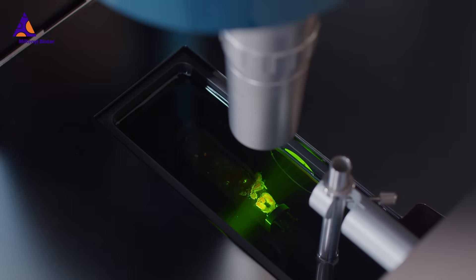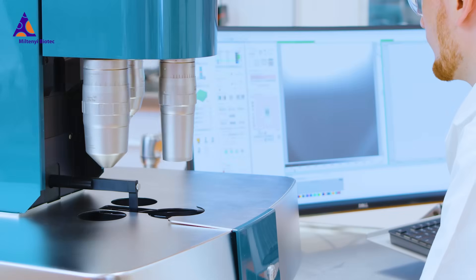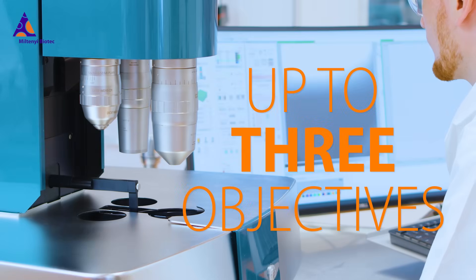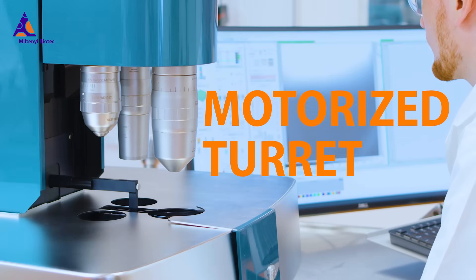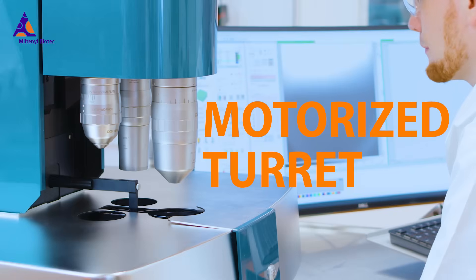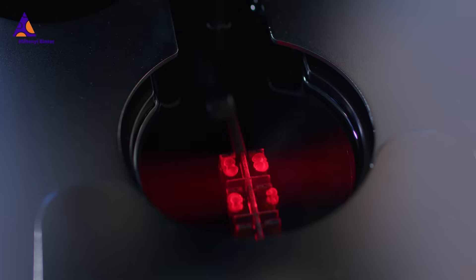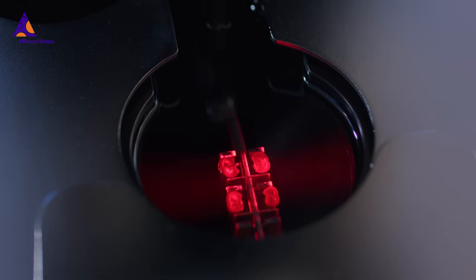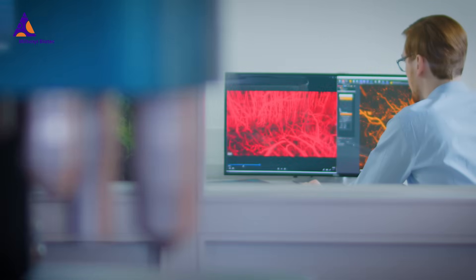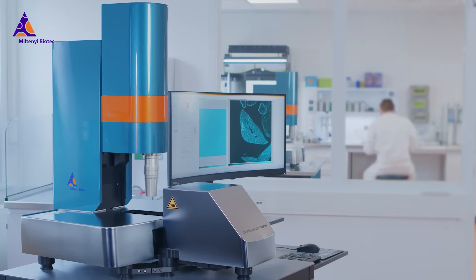The Ultramicroscope Blaze and Ultramicroscope Coros can be equipped with up to three objectives. A motorized turret on the Ultramicroscope Blaze allows fully automated switching of the lenses and enables you to get an overview of the sample and then analyze subcellular details without manual handling.